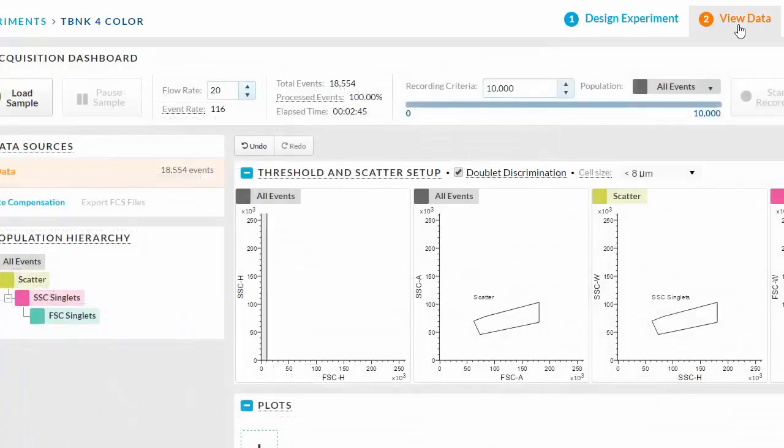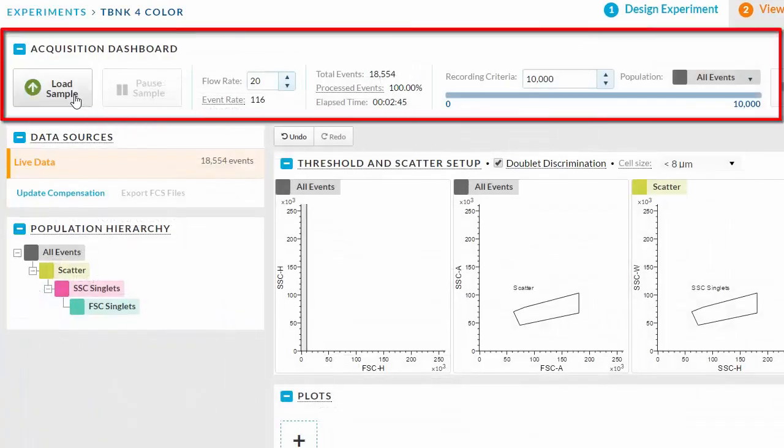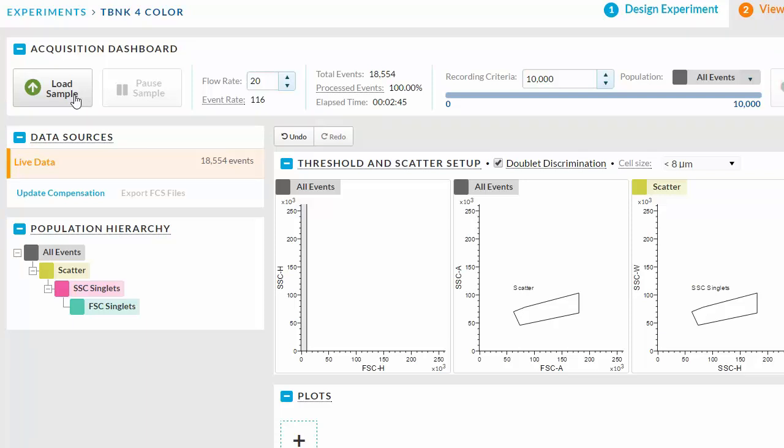At the top of the workspace you will find the Acquisition Dashboard. This is where you load and unload samples, adjust the flow rate, and record a data file.